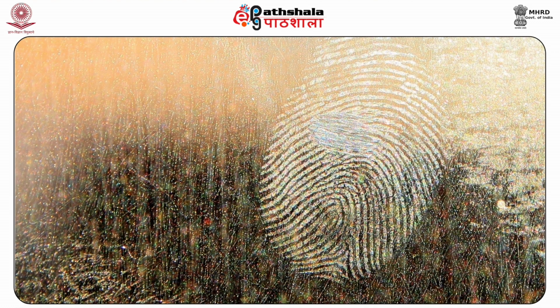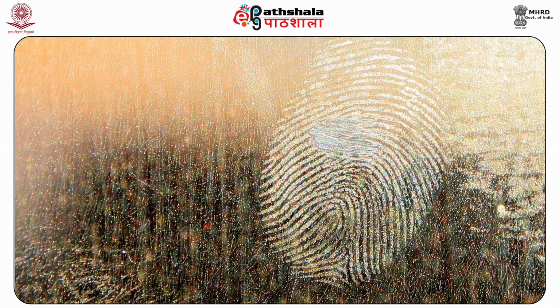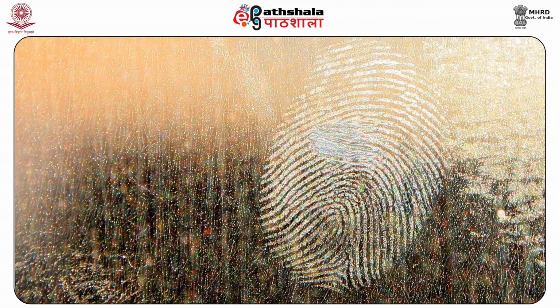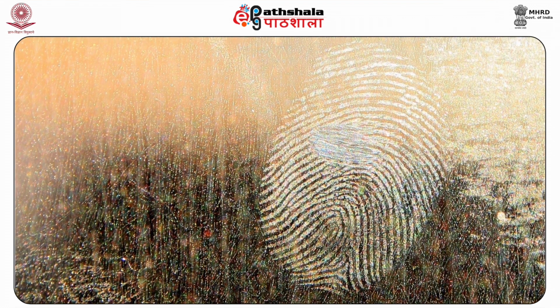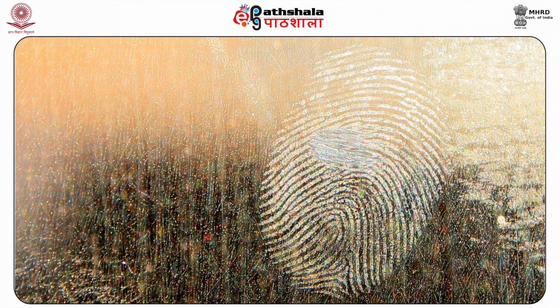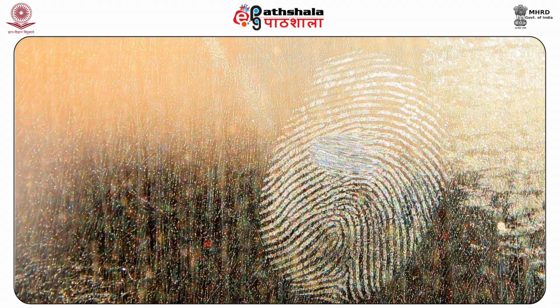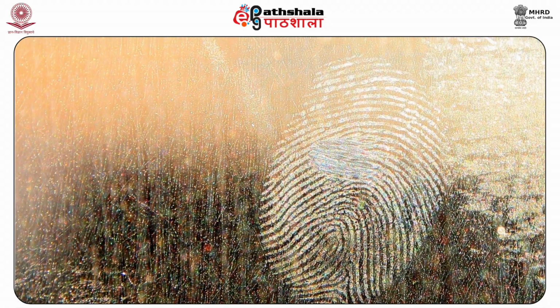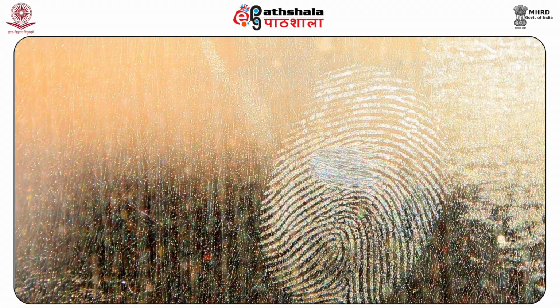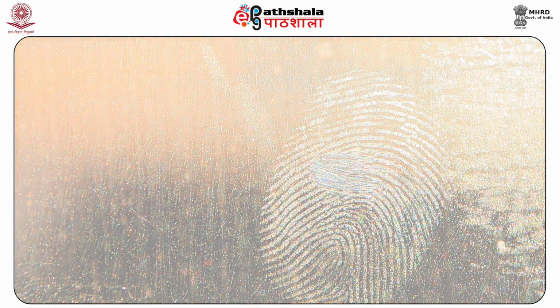Now, the object bearing the fingerprints is immersed in the working solution, which is then gently agitated by the shaker for about 15 minutes. Dark gray or black colored fingerprints are now developed. The object is thoroughly washed by immersing it in distilled water for 5 minutes. The washing operation is repeated twice more, each time with a fresh batch of distilled water.